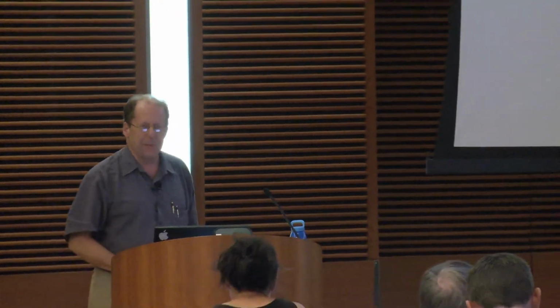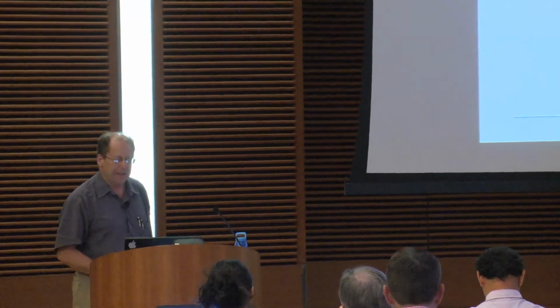We do not do a whole lot of biology. We have a fair amount, but I'm going to talk a little bit about a more material science type application. But the principles are all the same. Once you've got the picture in, it's just a bunch of pixels, and you have to do something with it.